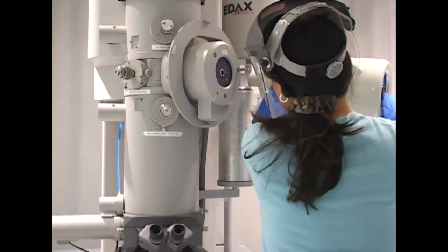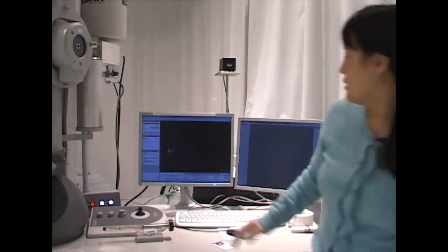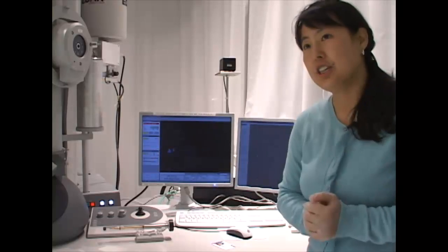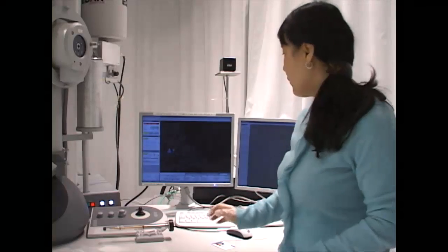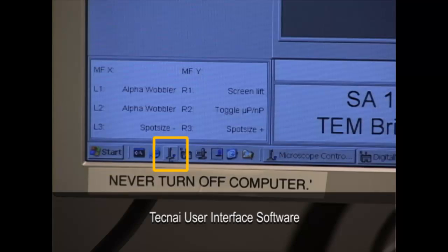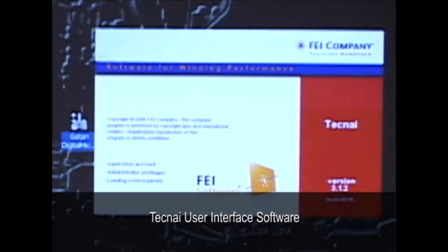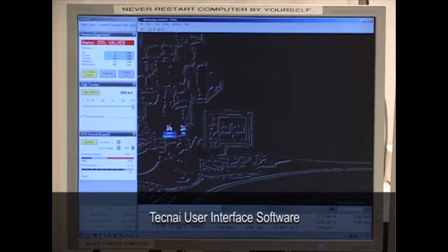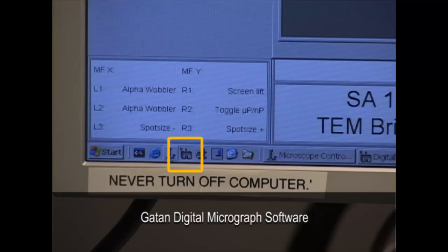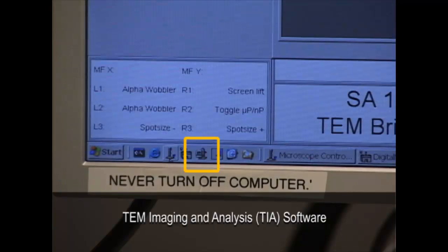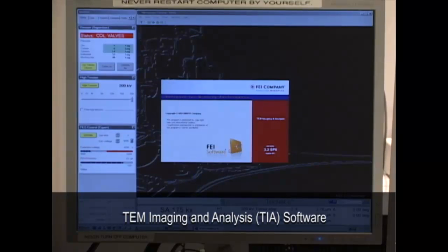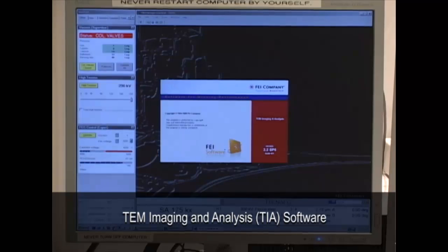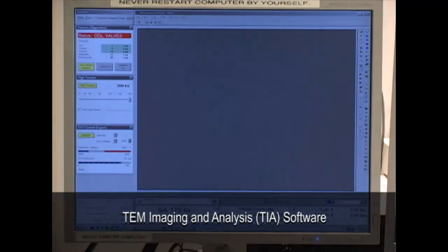The TEM uses four pieces of software, which should be opened in order. Open Tecnai User Interface Software, and you will hear a click-click, which confirms that the microscope is communicating with the computer. On the second monitor, we see the digital micrograph software. The third software is TIA, TEM Imaging and Analysis, which is used for recording scanning TEM and EDS.